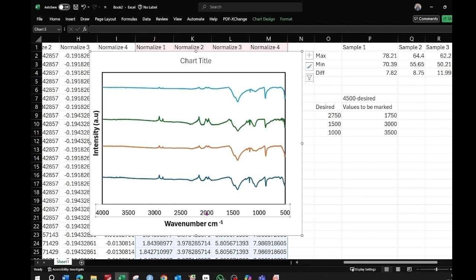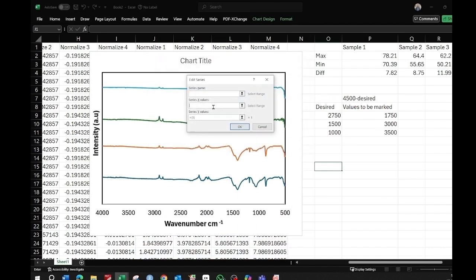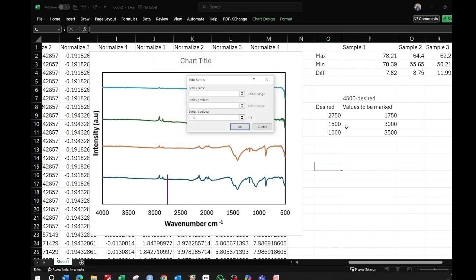To mark specific wave number values — for example 2750, 1500, and 1000 — right-click the x-axis and select data. Click Add and enter the x-axis value as 2750 twice, and in the y-axis give two values such as 0 and 2, then press OK. A small vertical line will be inserted at 2750. Repeat this for 1500 and 1000.